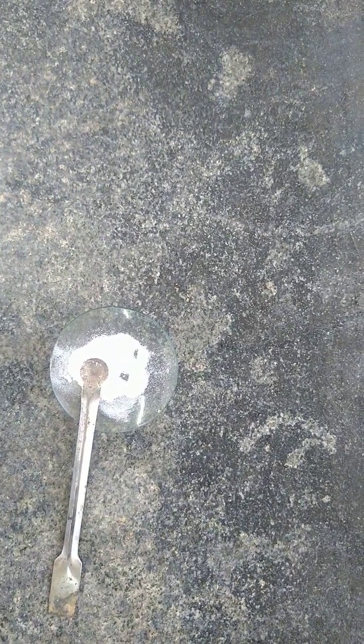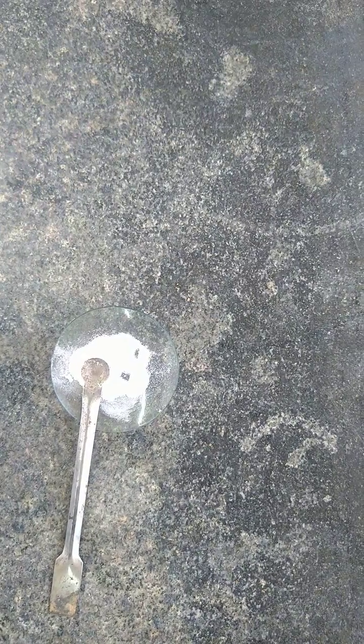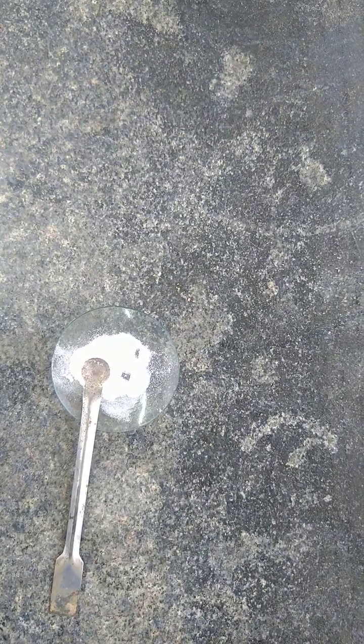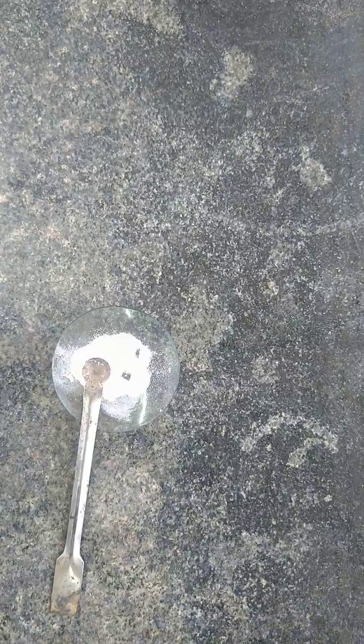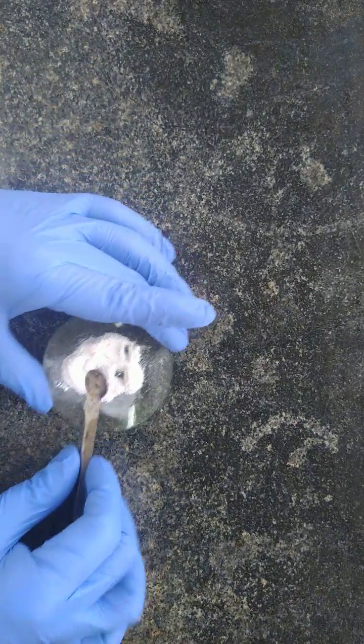Hello students, in this video we are going to start with systematic qualitative analysis, and this is the salt number 6 which we are going to analyze. So let us begin with the preliminary test. Okay, so look at this salt.